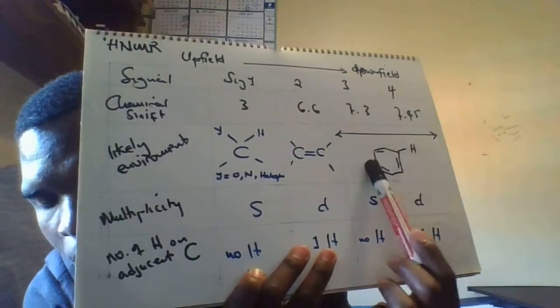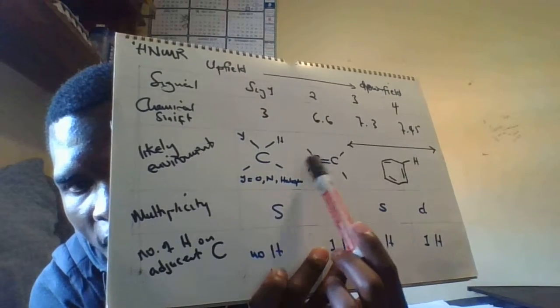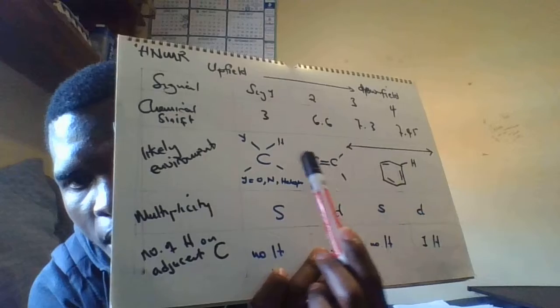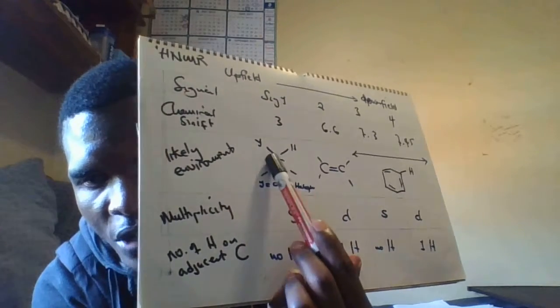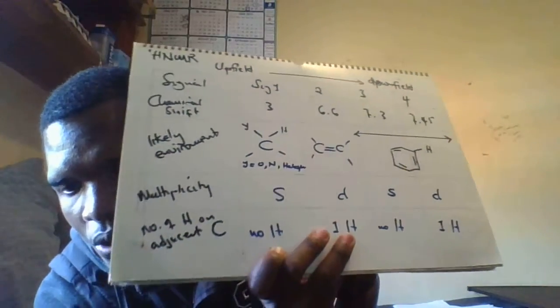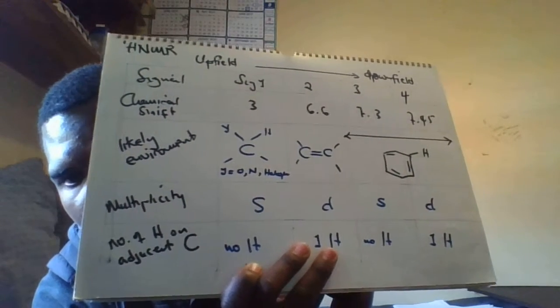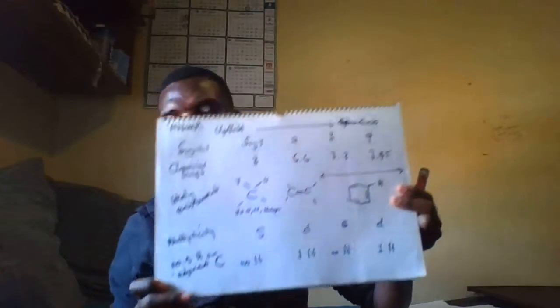So we now have a benzene ring, and we now have these double bonds, probably double bonds of the benzene ring also. Then here we have a carbon bonded to a nitrogen, so we are yet to see what's going on with our structure. Now let's tune into the carbon NMR that will actually give us a clue on what really is happening. So stay tuned.